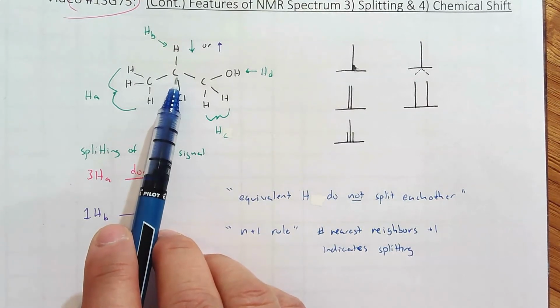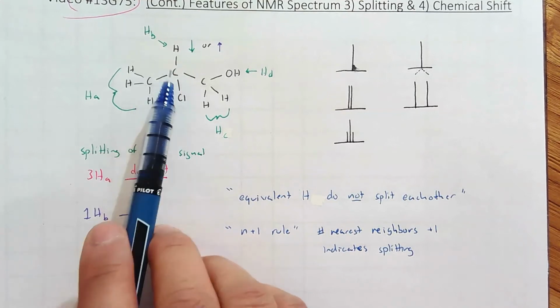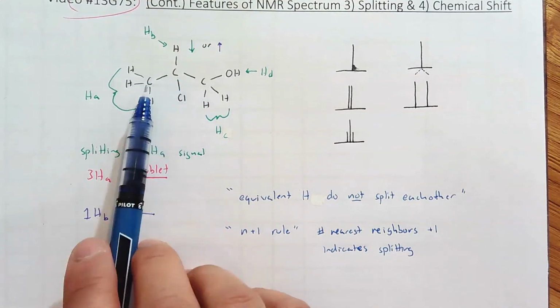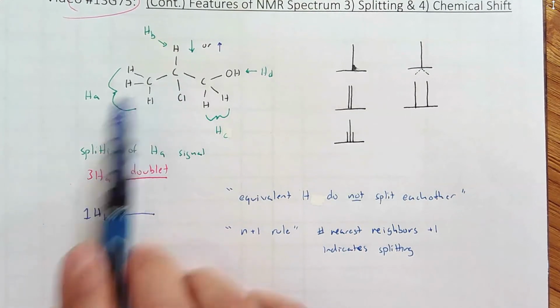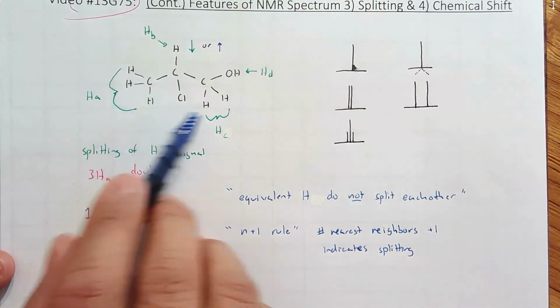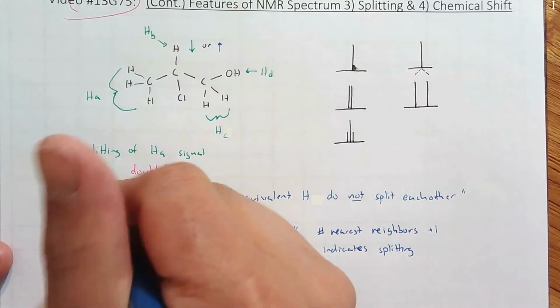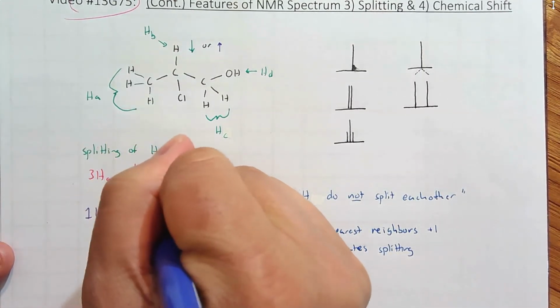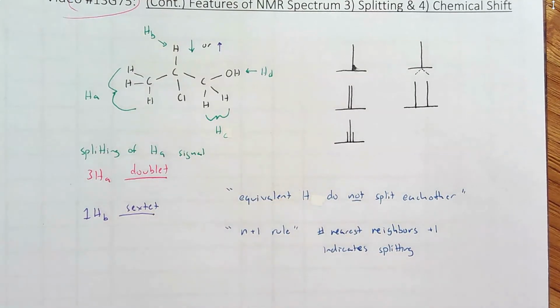I have 3 neighbors to the left, and I have 2 neighbors to the right. So you look at the house directly adjacent. You look at the neighboring house. It has 1, 2, 3, 4, 5. So 5 plus 1 is 6. Again, we have a sextet. I was really hoping for something smaller like a triplet or quartet.